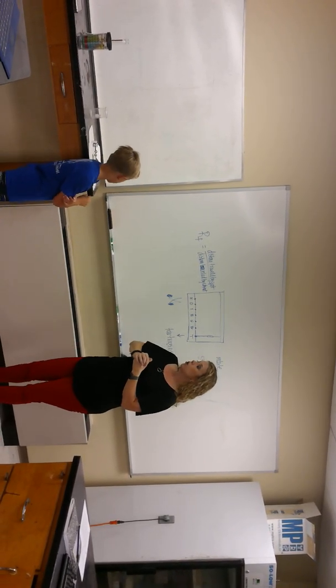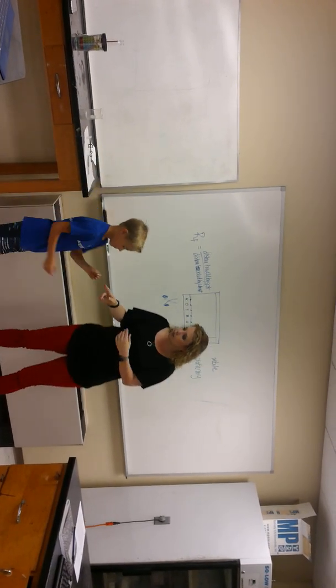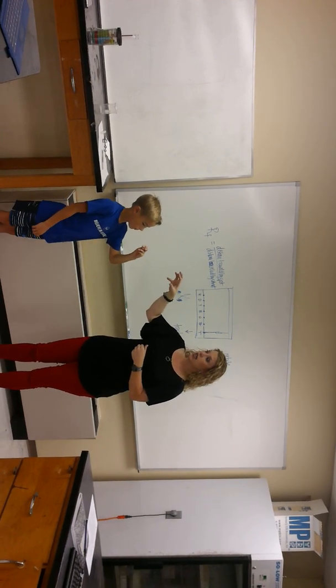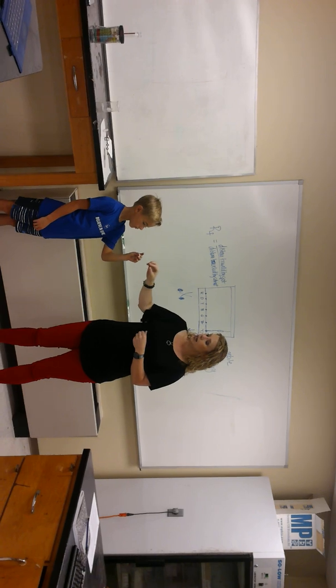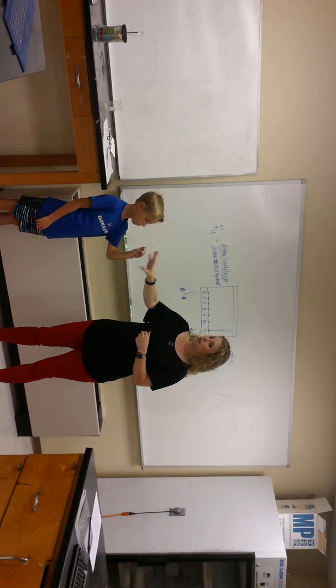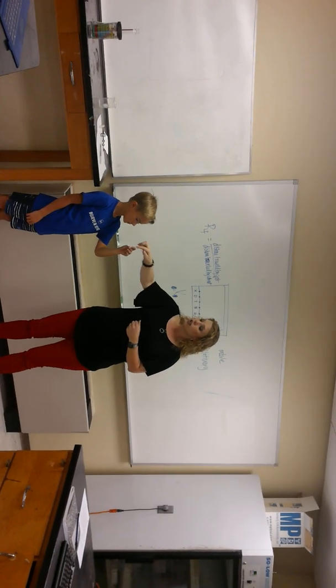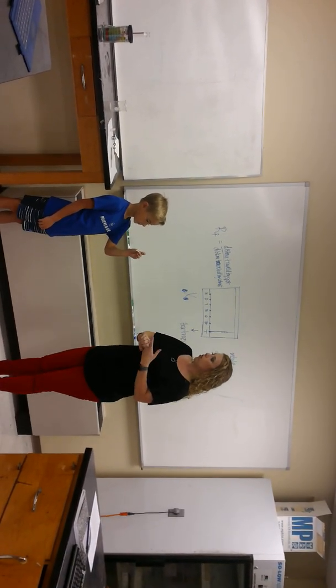So what we're going to do is use yarn. Show them our pieces of yarn. They're really, really small. All right, but what we're going to do is take the dye off the M&M, and then we're going to dye this piece of yarn so that it is the color of our M&M. Then we'll remove the dye from the yarn to make our solutions. That way we don't get the sugar and the chocolate and the fillers and all that kind of stuff.